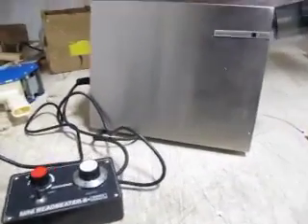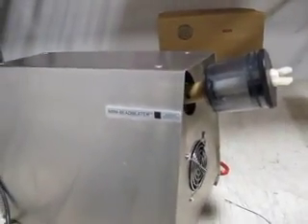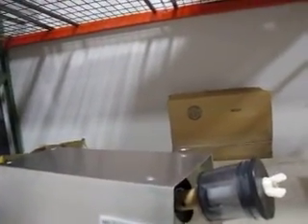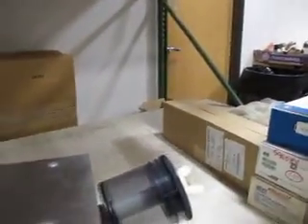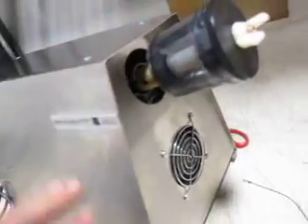You're bidding on a Mini Bead Beater 8, model 693. According to the tag, it runs from 0 to 3200 SPM, 120 volts, 10 amps. This is in really nice condition. This came from a large pharmaceutical company that was surplus to its needs.